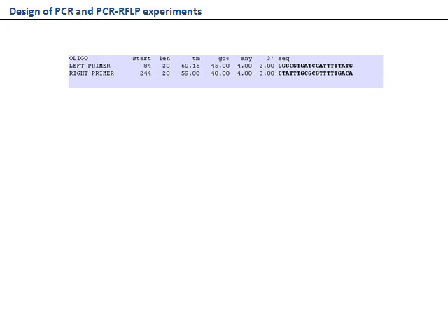The program Primer3 will suggest up to 5 pairs of primers. For each pair of primers, the program provides the following information. The left primer, also called the forward primer, is described on one line, and on the next line the right primer, the reverse, is described. Both primers' start position within the sequence, as well as their lengths, are shown, as is the GC content of each primer and the melting temperature, which are closely related. Additional information is also provided. The simulation program adds a button just below each pair of primers for easier selection of primers.